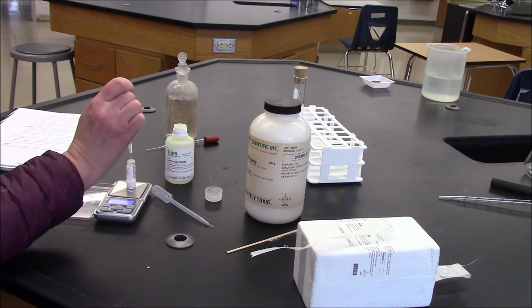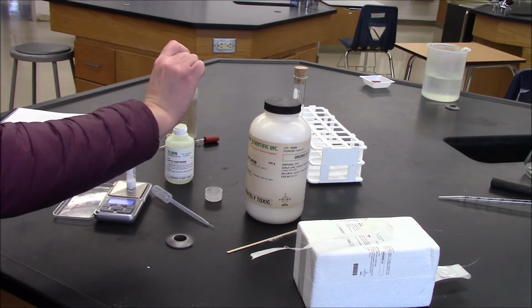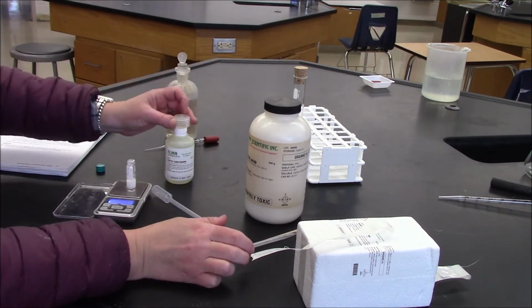At 1 gram, I'm going to try to add a drop at a time. And I have here 1.10 grams. So I'm going to go ahead and record that in my data table.